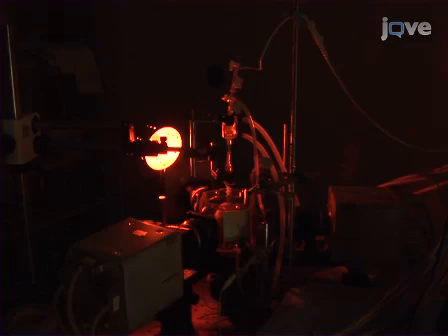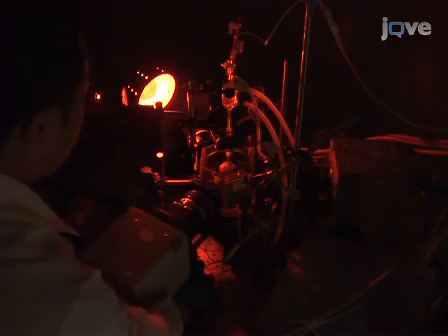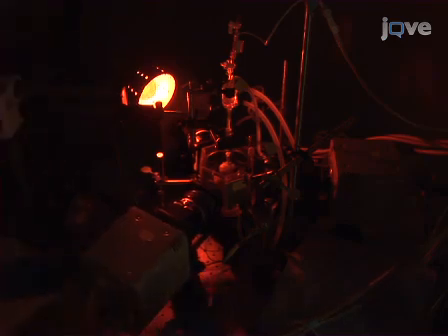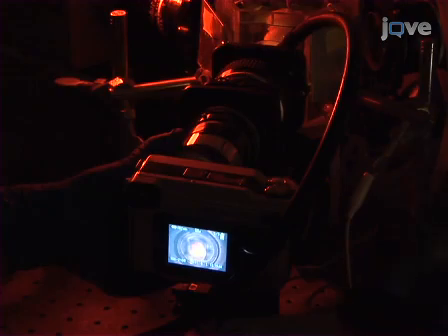Position the photodiode arrays, or PDAs, at 3 evenly spaced angles around the heart. Then, on each PDA, focus the image of the heart on the frosted glass of the image plane. Adjust the position of the cannula in the hexagon chamber and each PDA until the heart fits in the field of view of all 3 PDAs.